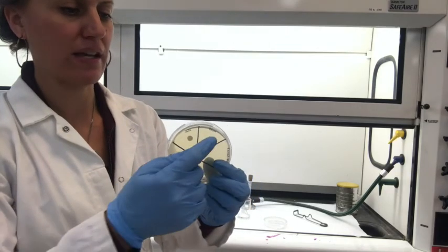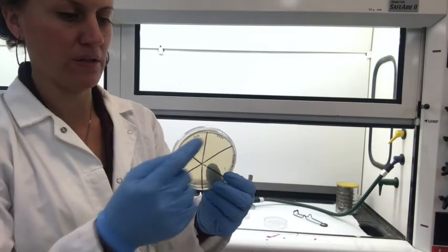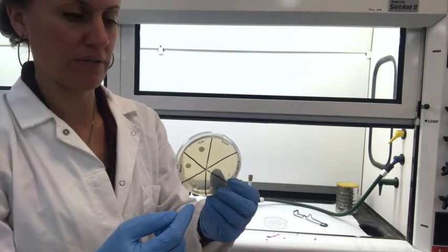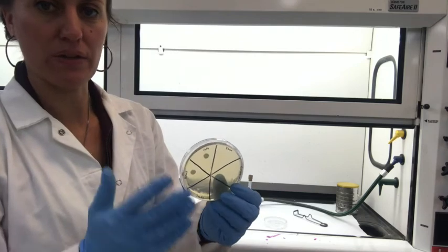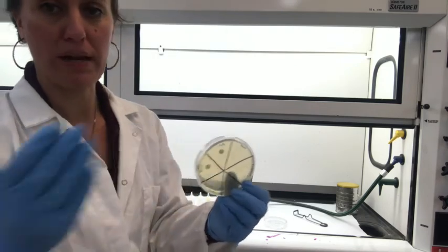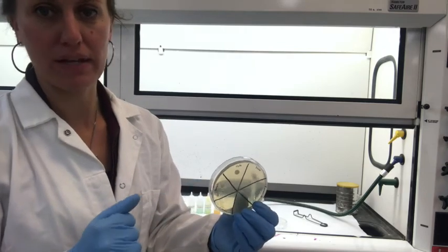And so in this exercise, we're just evaluating a relative comparison of the zones of inhibition with a circular clearing around each of the discs for all of these disinfectants, kind of relating one to the other with each bacteria, and then from one bacteria to another to see if there is an impact from gram-positives to gram-negatives, for example.